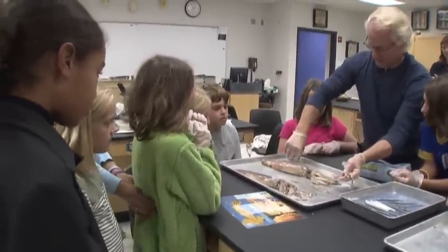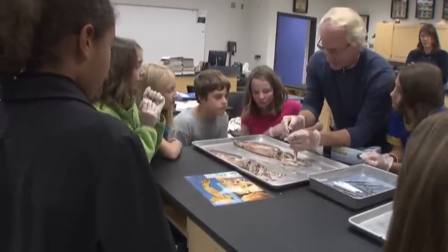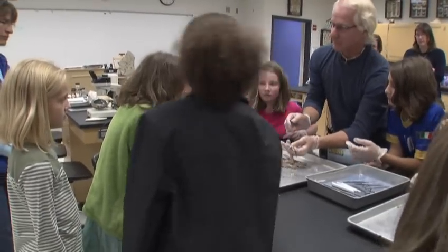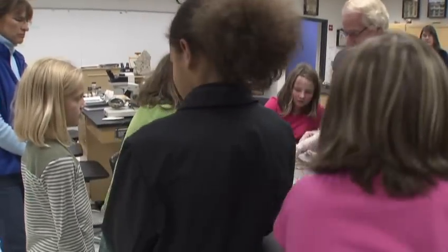So now, I know, isn't that gross? So now I'm going to look at some of the tentacles. You're going to see little tiny teeth in here. Look. Oh yeah, see that? Anybody want to hold that? Okay. I'll hold it. Now, do you guys want to touch this? Yeah, you can touch it. You got gloves. Oh, it's sticky.